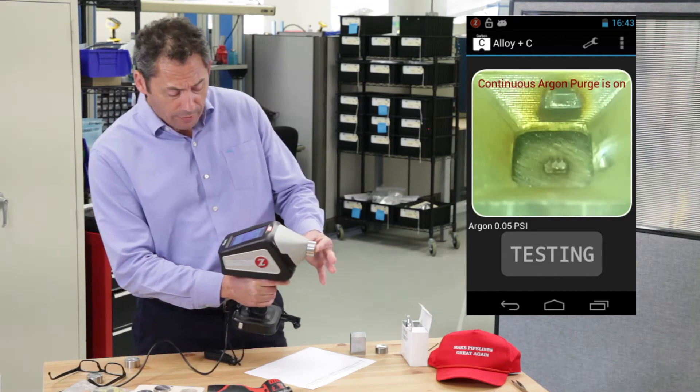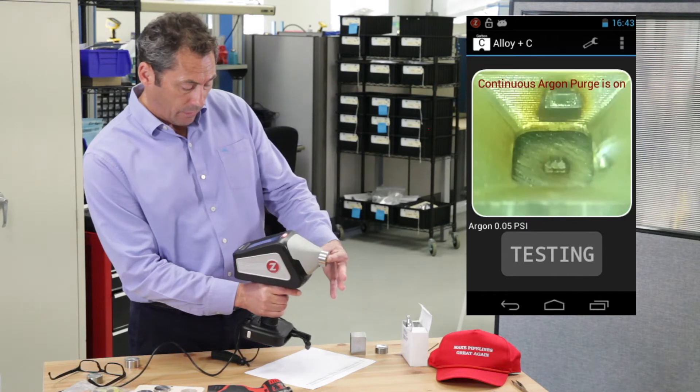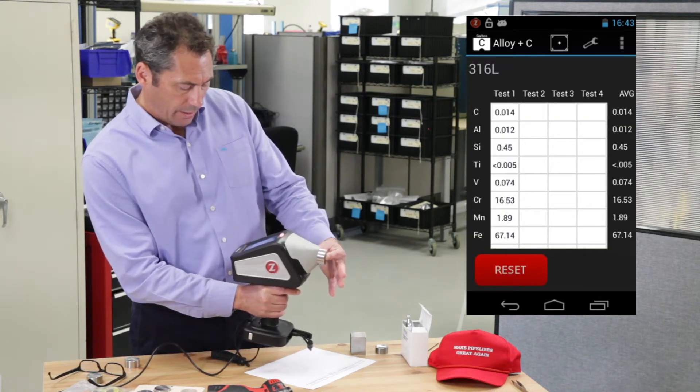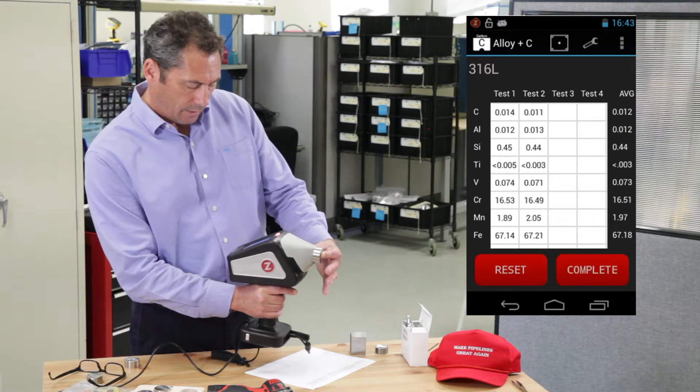And then we'll get our first result now. Let's see what we get here on this L-grade 316. Okay, good. One more test. Good.